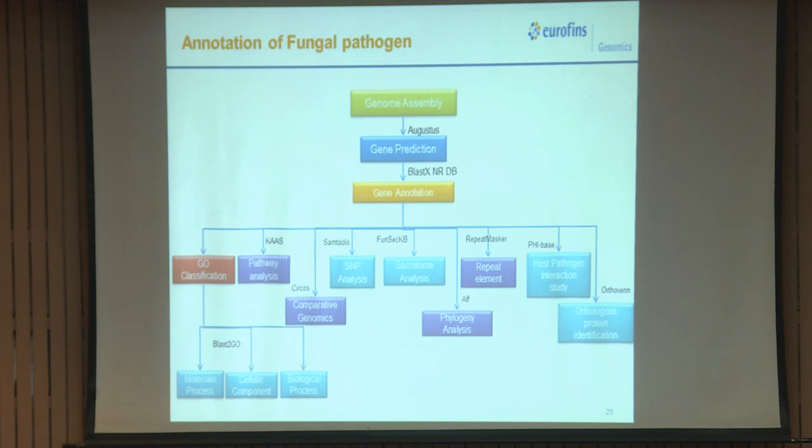After we have a genome, we do genome annotation. Genome annotation has several steps. We can do n number of things, but the basic is that we have a genome first. Once we have the genome, we do gene prediction using any in silico tool, and one of them is Augustus. We can identify the genes. For bacteria, there are tools like Prokka.